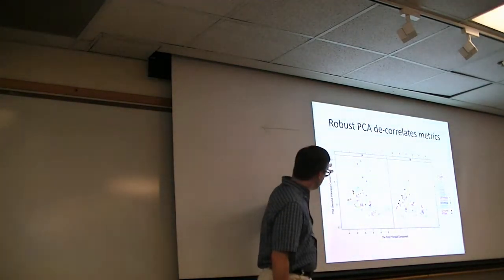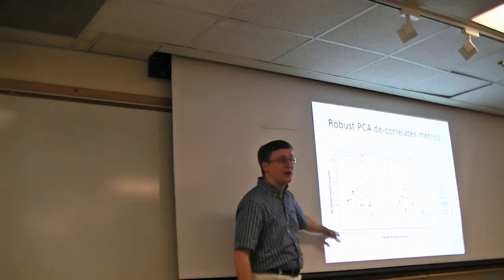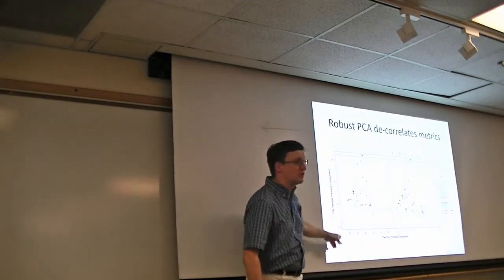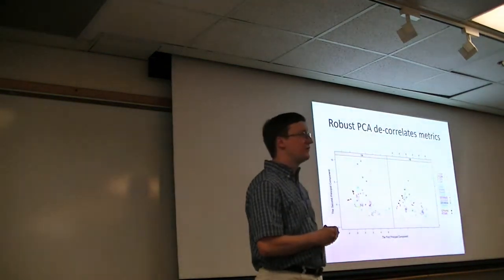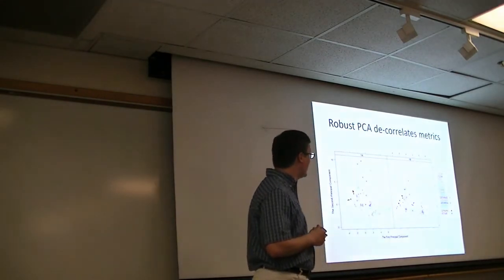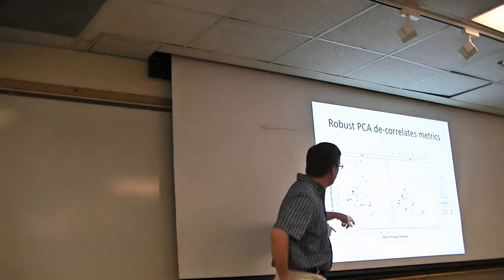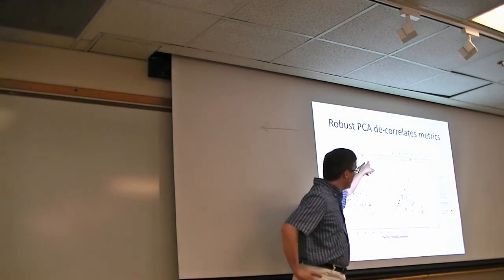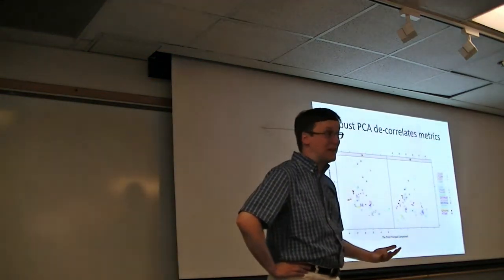So in this case, we're looking at the first principal component, i.e. the one that explains the most variance across the data set, and the second principal component, which explains the second most variability across the experiment. It's tempting, when you look at a graph like this, to say that being far apart is just inherently bad. For example, blue window panes here is something that we might worry about a good bit, because the blue window panes are all over the place.